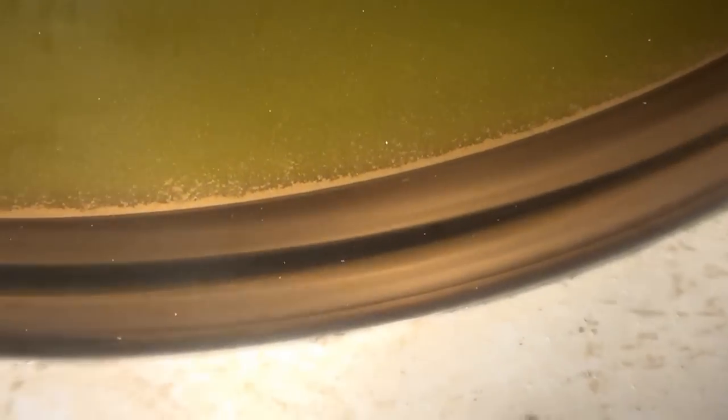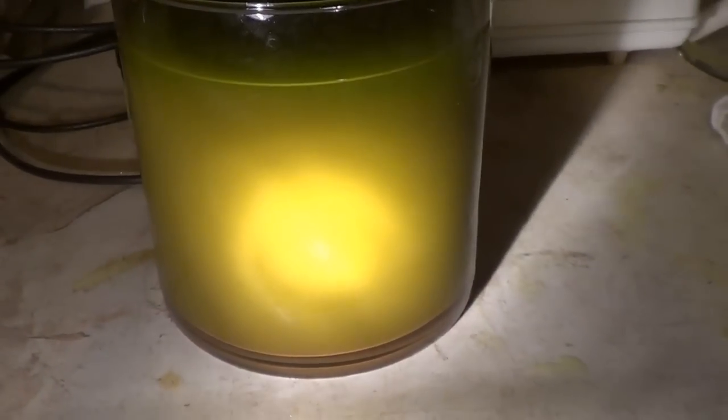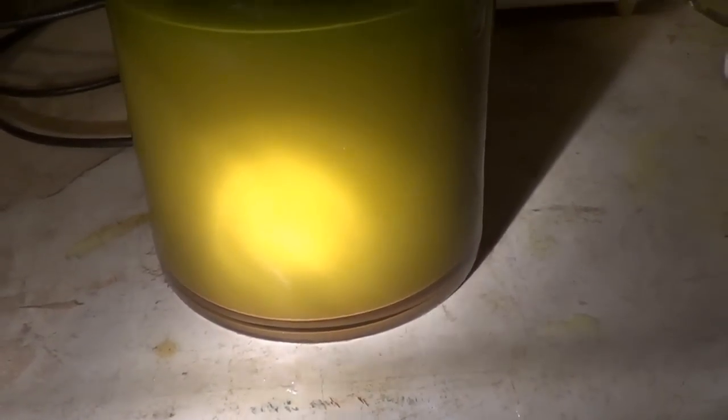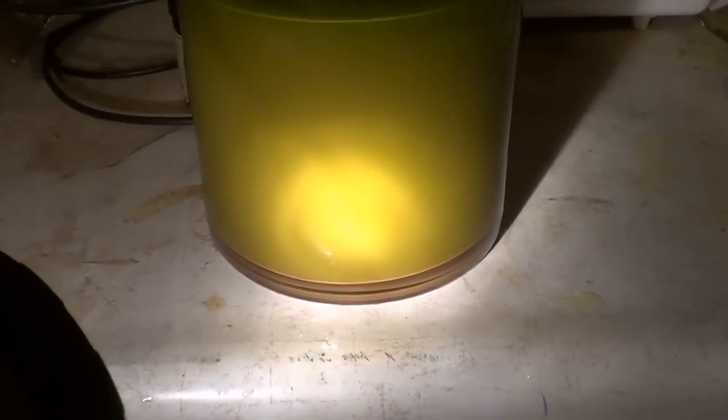Look at that gold forming on the bottom, it's all starting to settle. This is my second gold run - this is the first time actually using just pure raw gold. Before, I used scrap computer parts and precipitated the gold out of that, and I'll be doing that again this fall. I just wanted to do this quick run and see how it came out, and we got gold - pure gold.